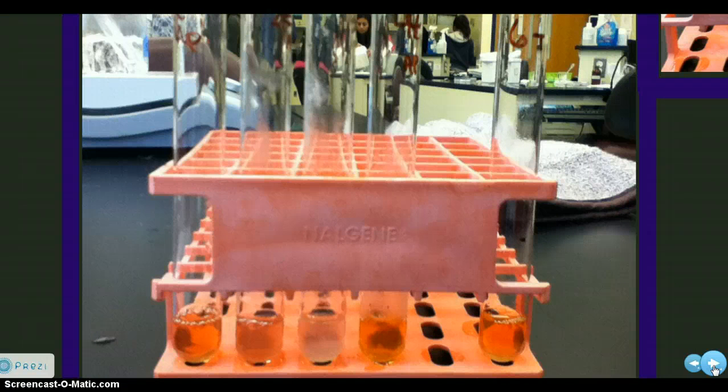And voila, here are our results. We find that test tube 1 at 40 degrees did really well. It got a shade of 3 in darkness. Oh, I forgot to tell you guys, we're basing these from 0 to 3: 0 meaning no change, 3 meaning a lot of change. So test tube 1 is a 3.